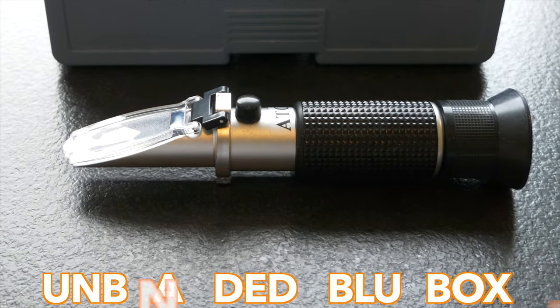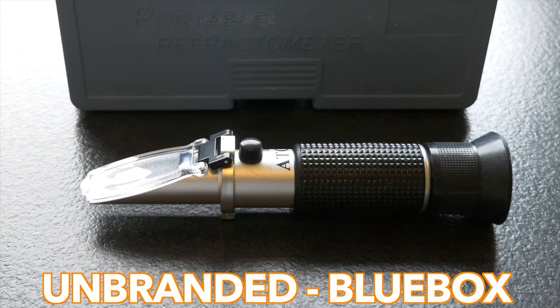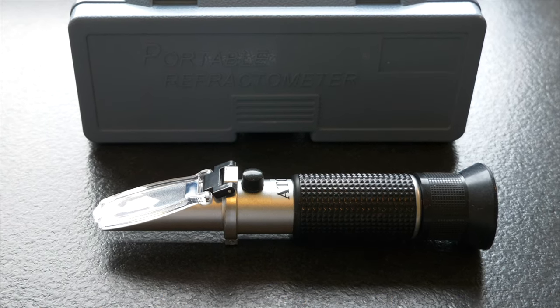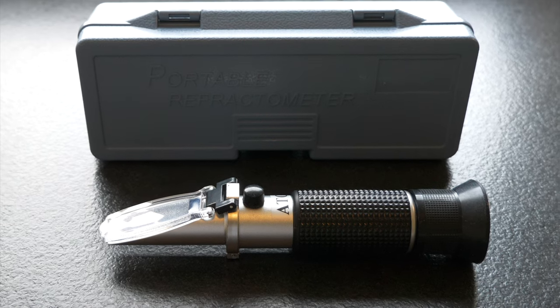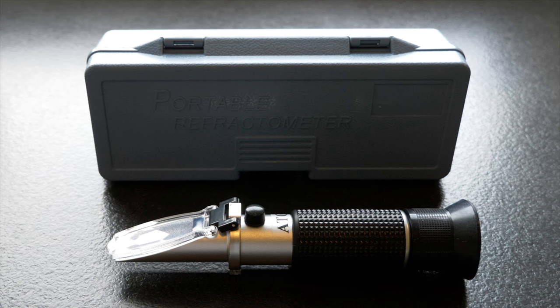Then lastly we have an unbranded blue box refractometer. These are very commonly found online and within homebrew stores. They are sold as a generic device for all sorts of analysis and really the only thing that changes is a display added into the reading viewfinder. The versions that have specific gravity can be used for pool and aquarium analysis, for example, but also for brewing — as such they are not tuned for anything specific, meaning that the accuracy for brewing is not going to be great, though it is fair to say they can vary. I have certainly owned some that have been more accurate than others, but you will never know unless you have access to something actually accurate to pair it to.